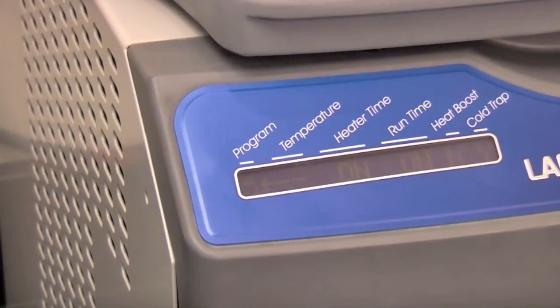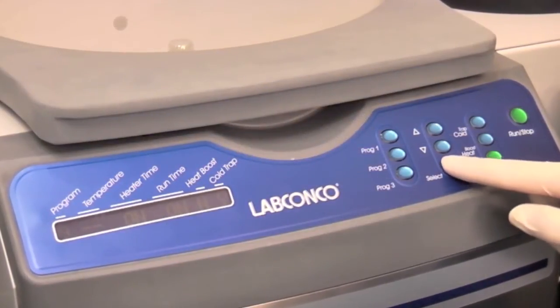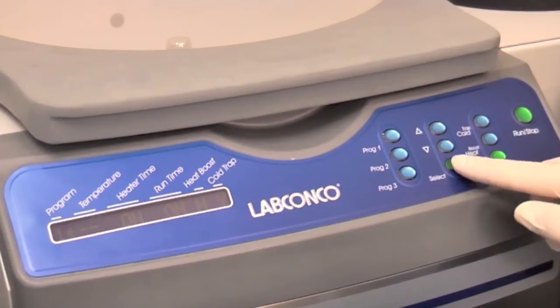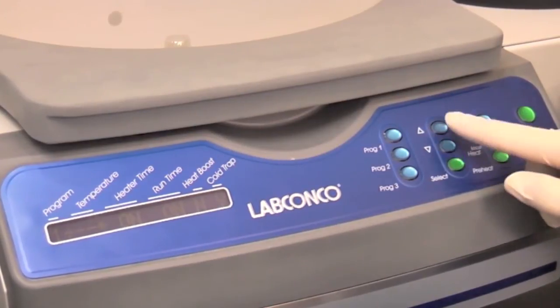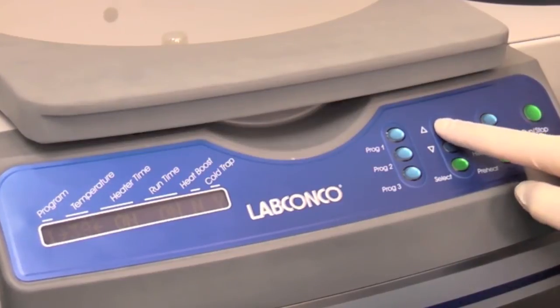Nine user set programs are available. An example program follows. Press select until the arrow is pointing to programs and choose program 1. Press select. The arrows will move to temperature. Set the temperature to 45 degrees Celsius.